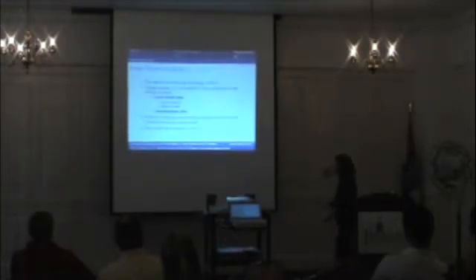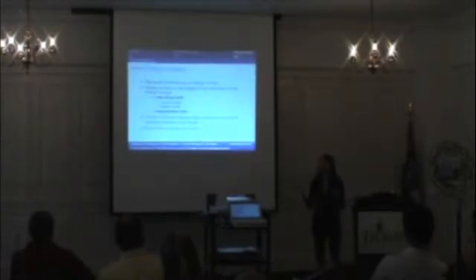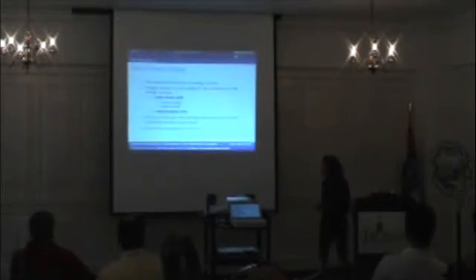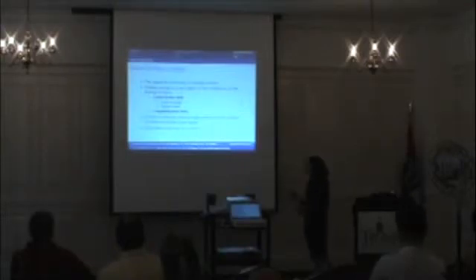These are based generally on finding the boundary as opposed to the overall picture of the object. Most of these methods are the result of minimizing an energy function, which is kind of neat because the GGH model is all about minimizing energy. Active contours are also called snakes, which is neat.